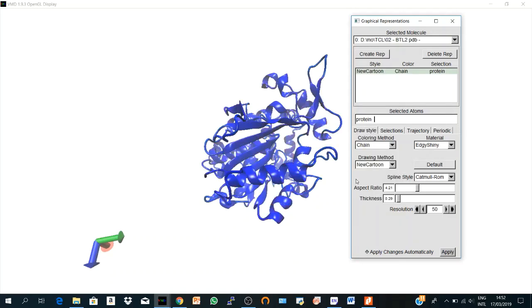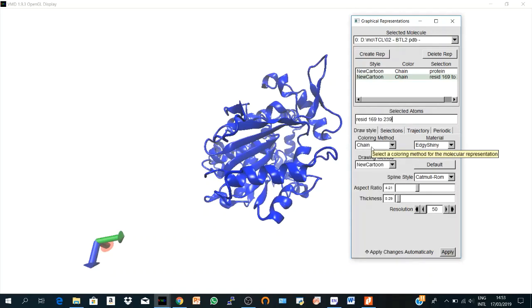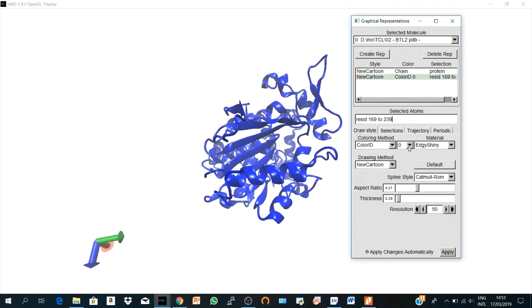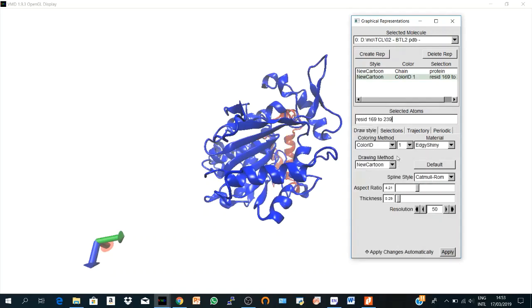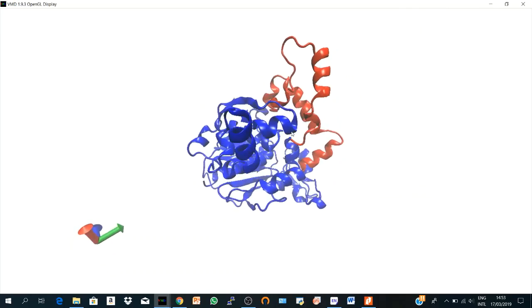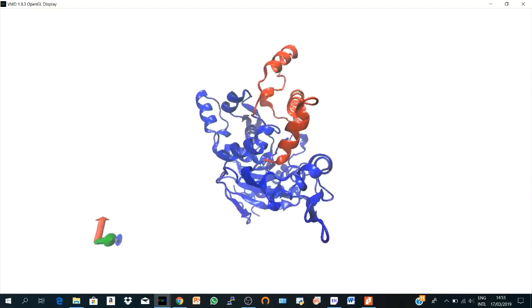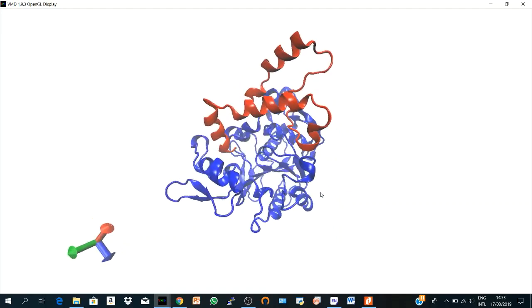And you could also color a specific part of your protein with different color. So let's create another representation which is ResID 169 to say 239. And I hit enter. And I created it according to chain, New Cartoon, but I want to change the color. So I go to Color ID and let's make it red. So you see, here you have a specific part of your structure which is colored in a different color.